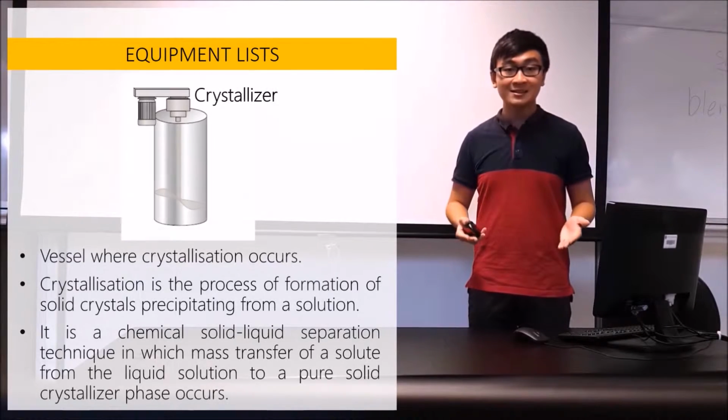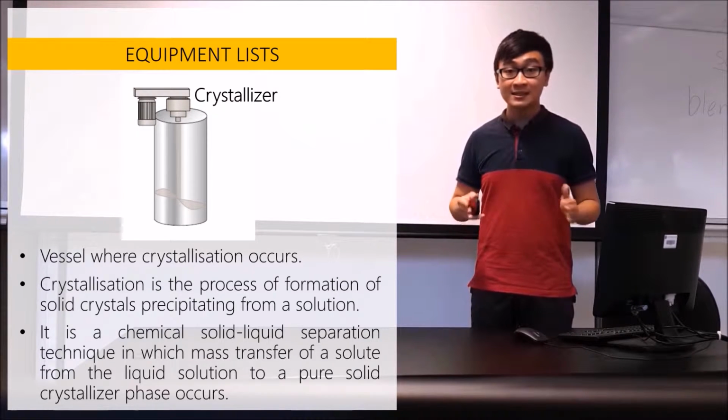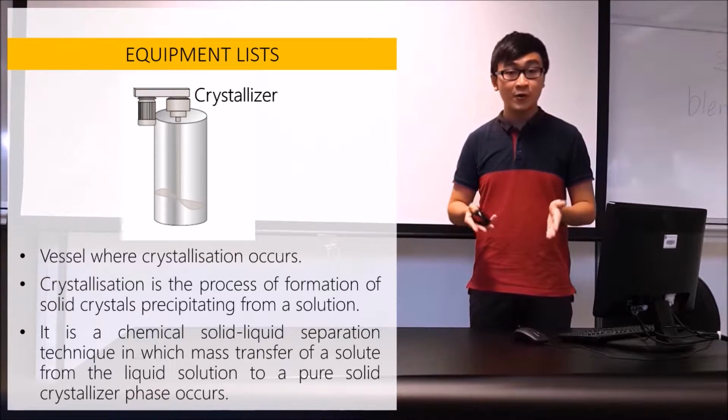Crystallizer is a vessel where crystallization occurs. Crystallization is the process of formation of solid crystal precipitating from a solution.